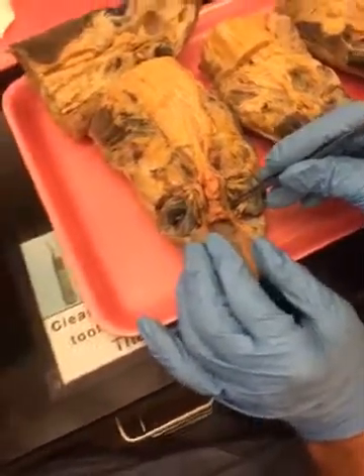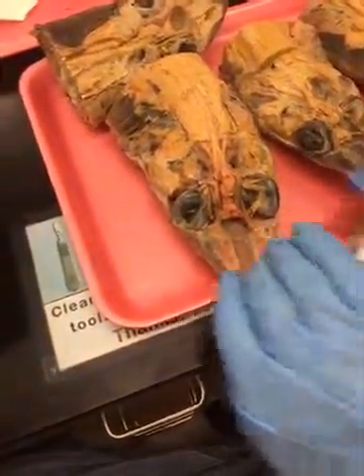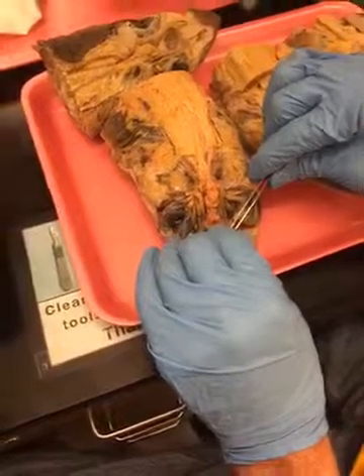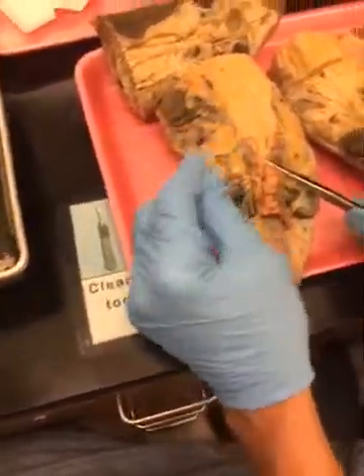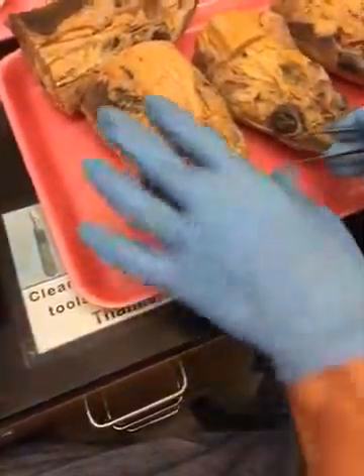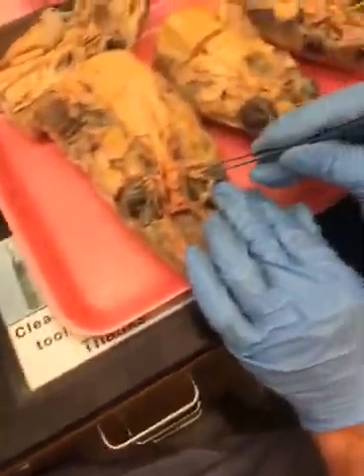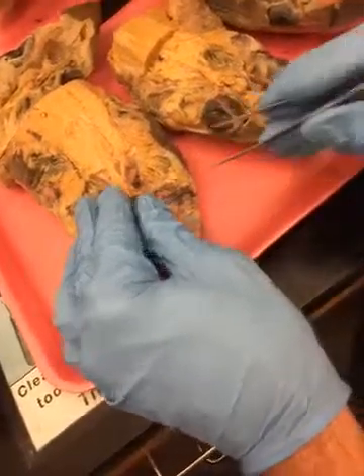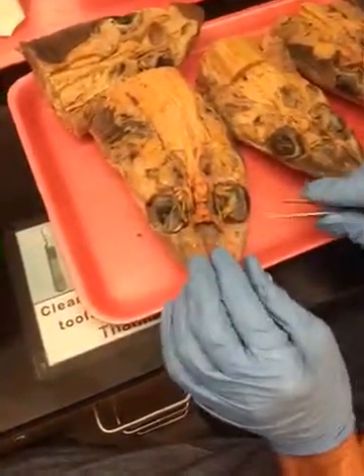Now, since we're doing eyes, we should do the muscles so you don't mistake a muscle for a nerve. Two eye muscles run this way. They're called the obliques. Think of them as running at an oblique angle. Four run this way. They're called the rectuses. So this is the dorsal oblique, and underneath it is the ventral oblique. This is the dorsal rectus, the medial rectus, the lateral rectus, and underneath is a ventral rectus. So those are very straightforward. Now, back to the nerves.